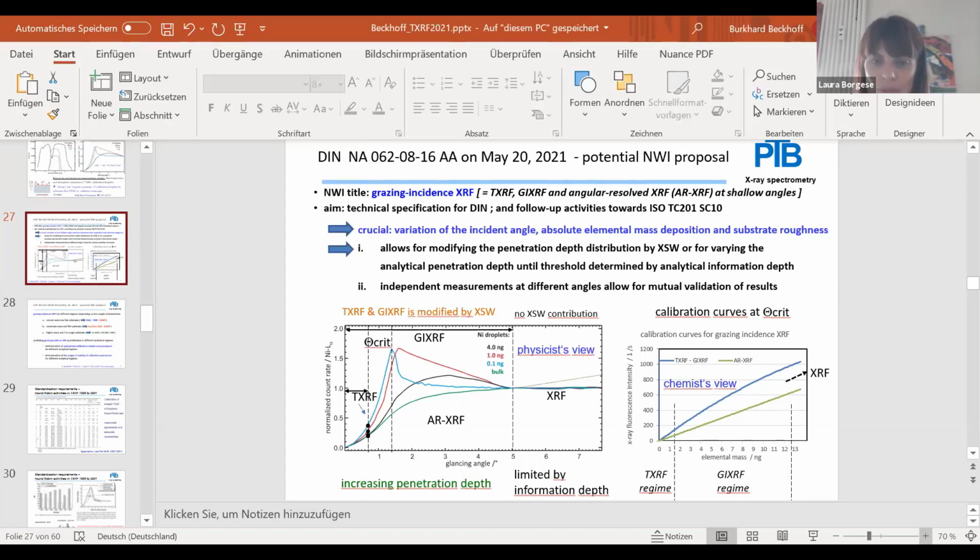Also, in the case of water, we have this issue with the instrument that we currently use in the lab, which is a box, and sometimes the repeatability of the same sample measured inside and outside or from the chamber is not as good as we can use for a calibration curve like this. But if there is a good repeatability, then we can produce such curves quite easily.